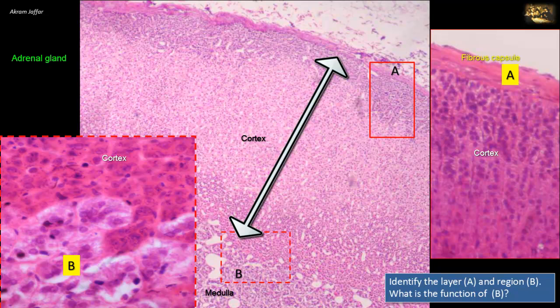B is the centrally placed medulla, consisting of closely packed clusters of secretory cells, numerous capillaries and venules. The cells of the adrenal medulla secrete the catecholamine hormones: adrenaline and noradrenaline, also called epinephrine and norepinephrine.